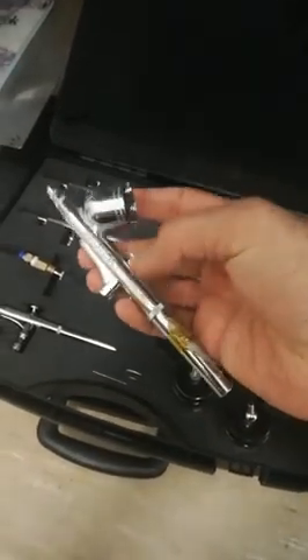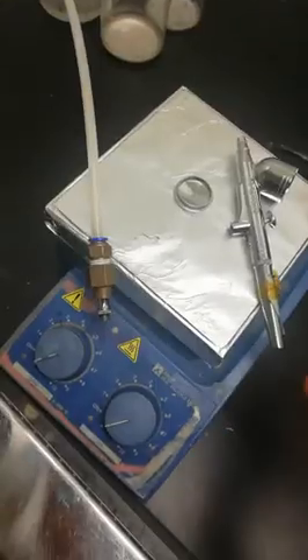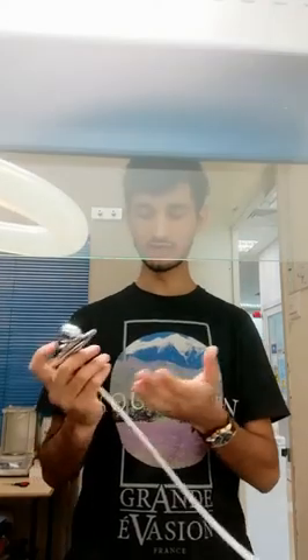This brush can be used for the silver nanowire spray coating. Connect this brush with the nitrogen cast. Now check the pressure of the nitrogen.